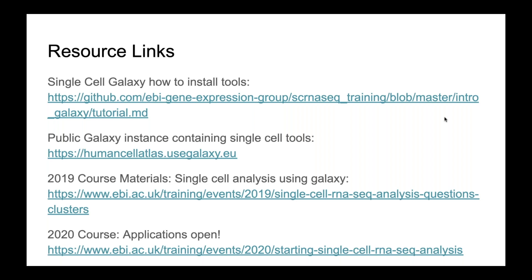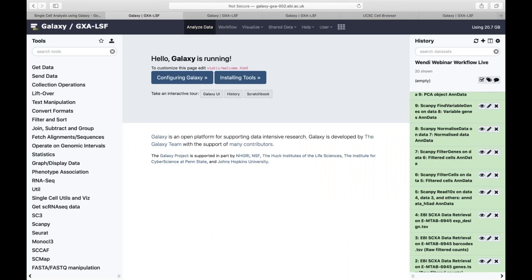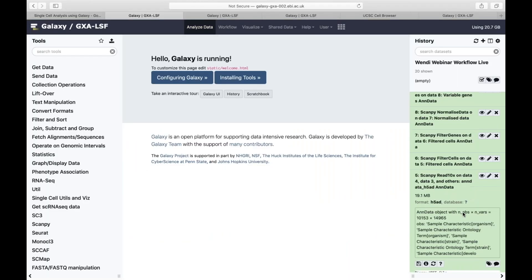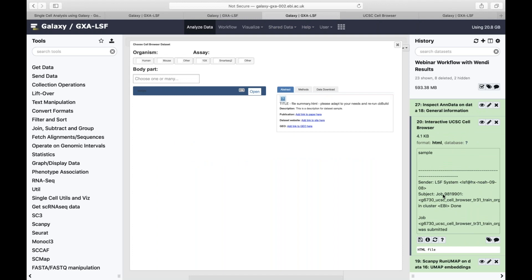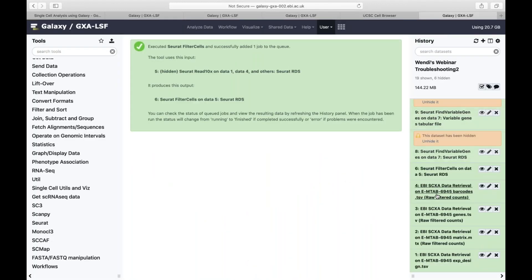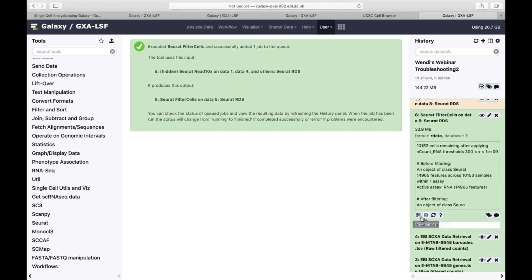Excellent question: after certain steps, is it possible to bring data out to analyze on another platform? Yes — when I first started testing this I ran Seurat and at each step I would take the data out into R to compare and verify. You can definitely do that. If you come over to any step, clicking view data will often automatically download that object. For instance, the R object will be in R data format, so you can absolutely take it out at each step.